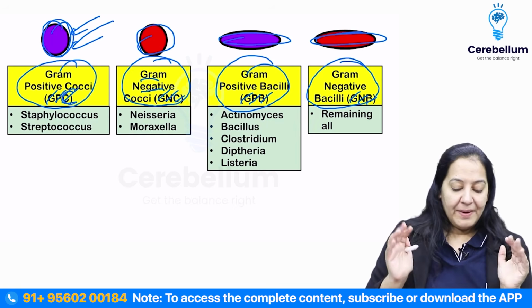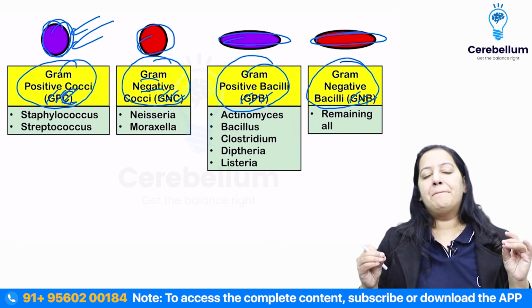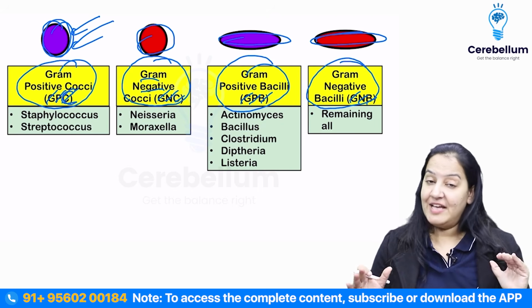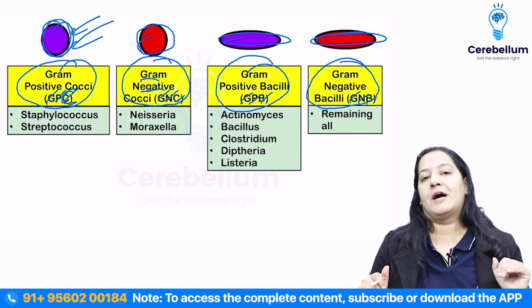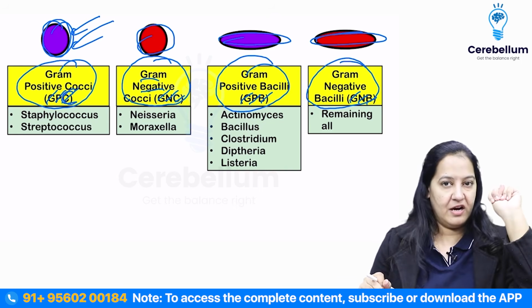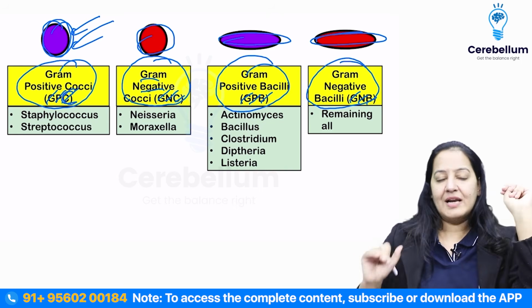Now, the color and shape are the biggest clue given to you in the question. Sometimes you will get an image-based question in microbiology in your exam. So in the image, they can show you the bacteria. You have to see the two things in the bacteria to decide its gram classification.